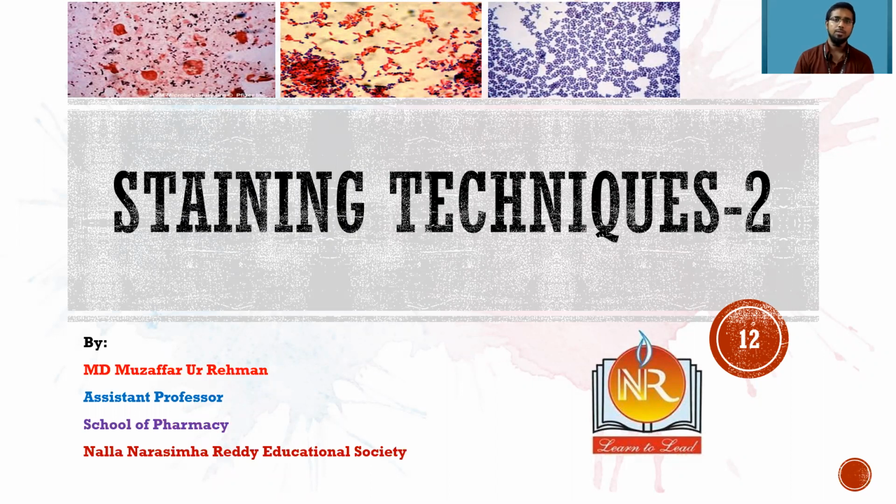Today's class will be studying the visualization differential staining technique, which includes endospore staining, okay, and after that we'll be studying flagellar staining, nuclear staining, and the capsule staining, okay.